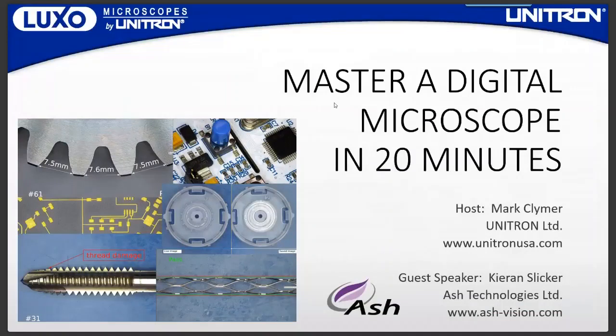Today, our guest speaker is going to show you how you can master a digital microscope in 20 minutes. I'm Mark Clymer. I'm the Director of Marketing at Unitron. Our guest speaker today is Kieran Slicker, and he's with Ash Technologies, and they're the developer of digital microscope solutions such as the Omni, Inspex HD, and Ion 4.3.